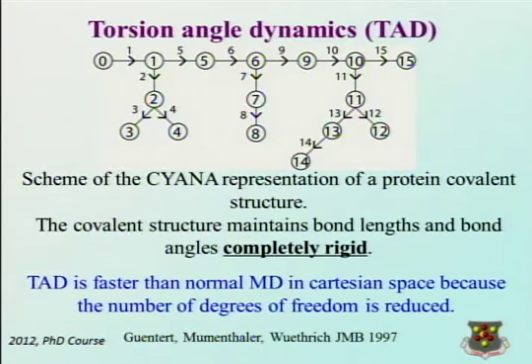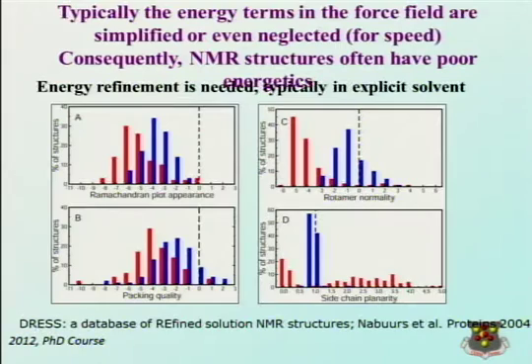And this is, together with the use of torsion angle dynamics, motivated by the fact that we want the structure calculation to be really fast, so that you can run it quickly and then look at the structure and see if you have errors in your data assignments, correct the errors, rerun the structure calculation, and so on. And if you have gone through this process, which is actually quite painful often, it can take several weeks. And during these several weeks, you will spend 90% of your time looking at the spectra, and only 10% of the time is going into the actual structure calculation.